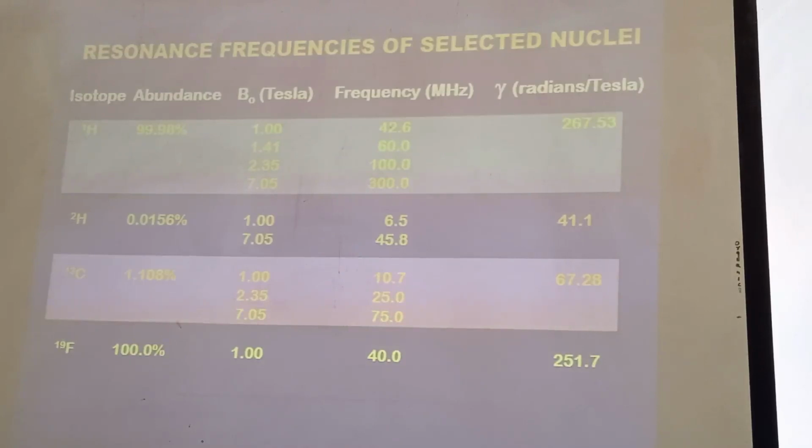It is easily detectable. You can have a good proton NMR spectrum with a smaller quantity of your sample than carbon-13. The spectrum would be clear, and because of the difference in Larmor frequencies, for proton there would be a larger excess of population between alpha and beta states than carbon-13 under the same magnetic field strength. ये जो एनर्जी गैप है ना, ये एक मैग्नेटिक फील्ड के सबके लिए सेम नहीं होगा. प्रोटॉन के लिए अलग होगा, कार्बन-13 के लिए अलग होगा.